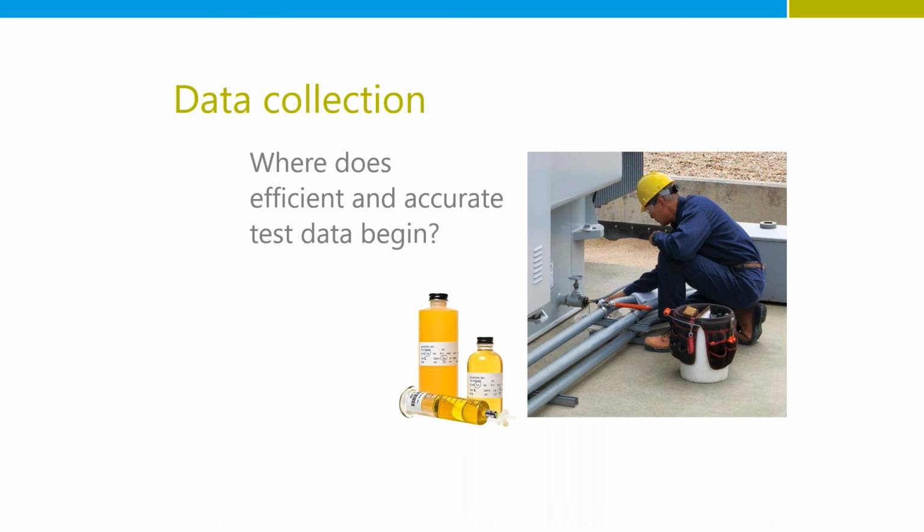I think you're right on there, Bill. Kind of in conjunction with that, out in the field, the next step when we talk about data collection is really that registration process. So after that sample actually shows up in the lab, do you have any tips or just ideas on what we need to do once that sample hits the lab to be able to register it properly so it flows through the rest of the process in an appropriate manner?